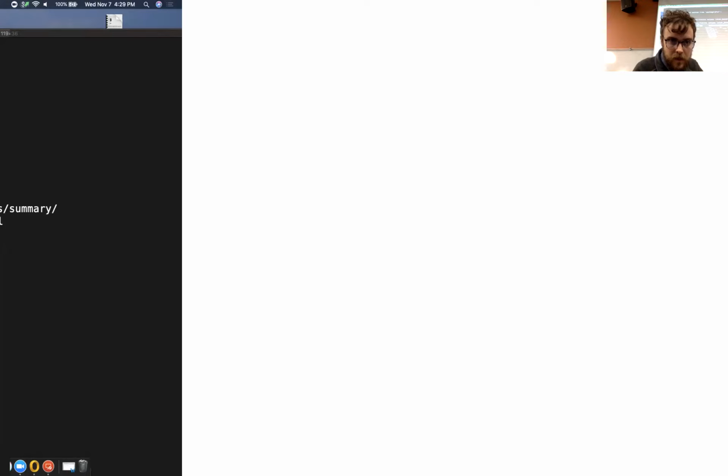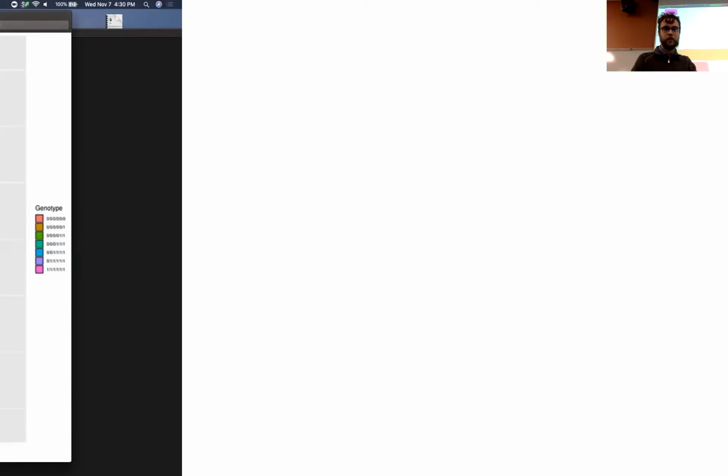One last thing you might take a look at is the minor allele frequency. If you remember, we talked about how base calling errors can lead to a lot of minor alleles, and if you remove that up front, then you get an accurate distribution of the allele frequency in the actual population.